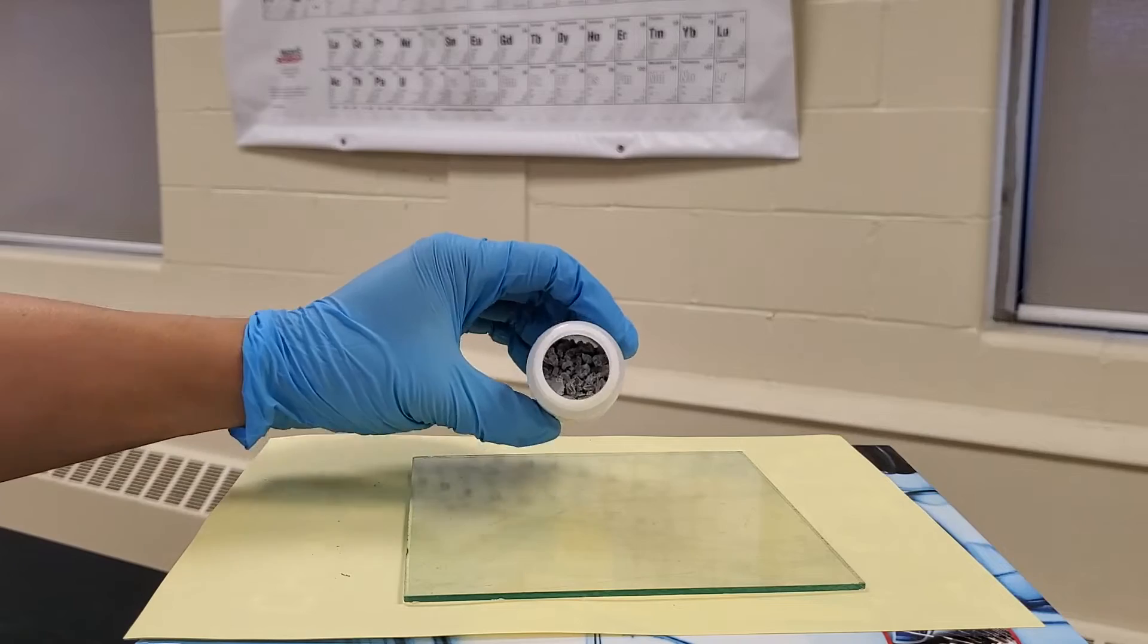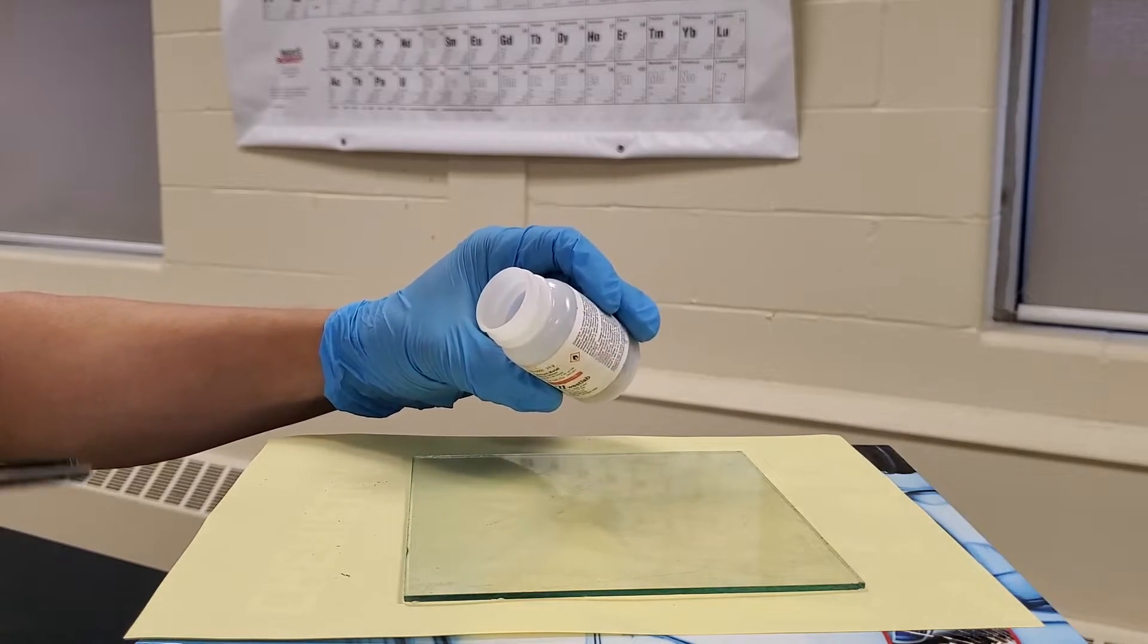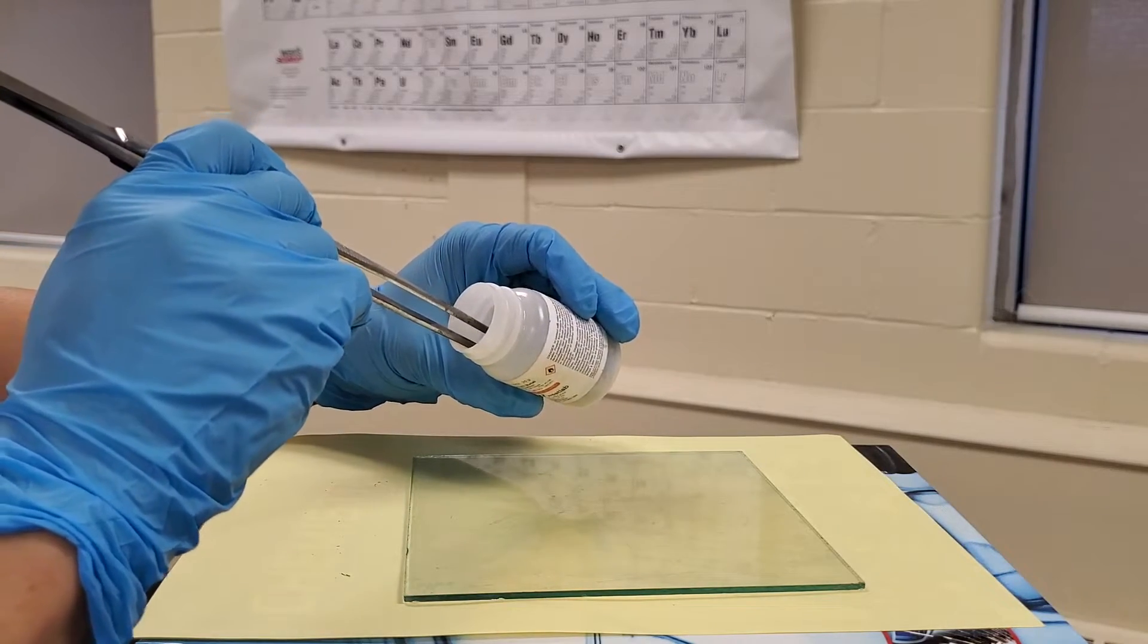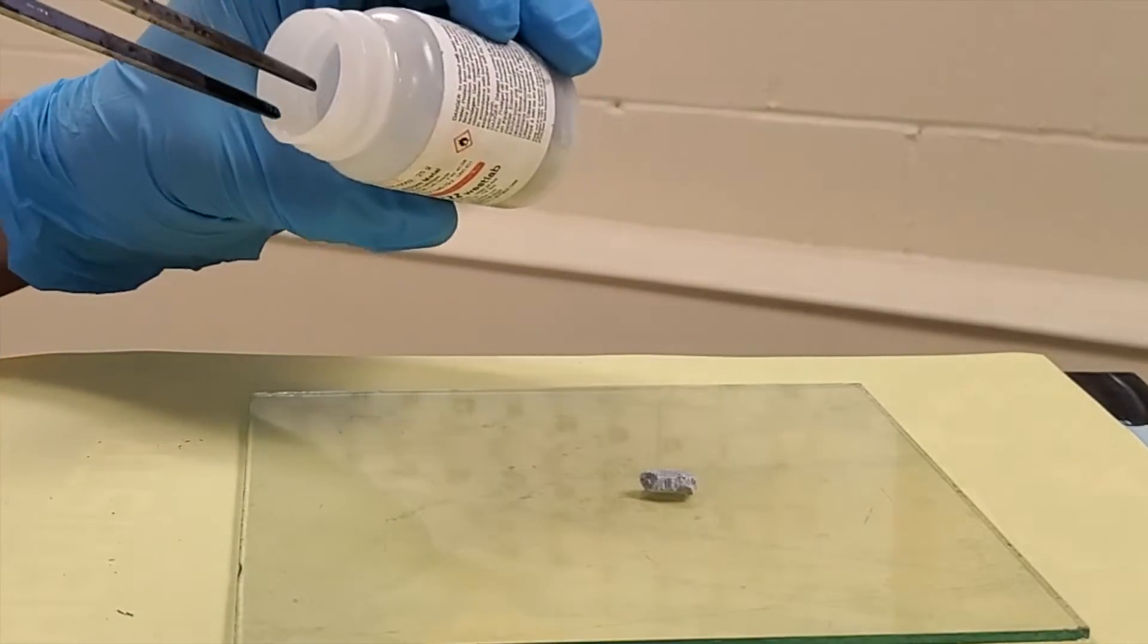This is what calcium looks like. If you weren't paying attention, it would just look like a rock. Gray, dull, and hard.